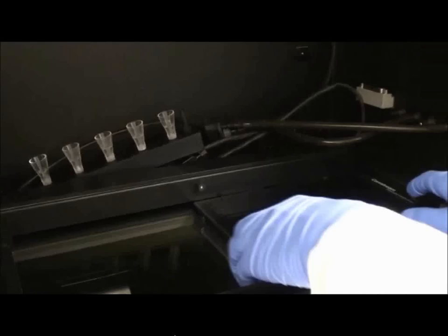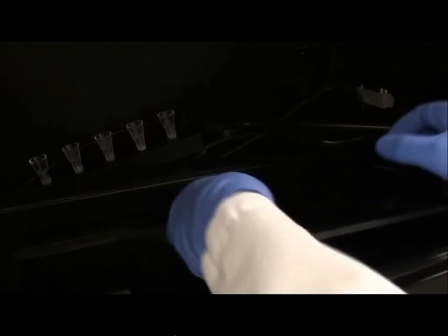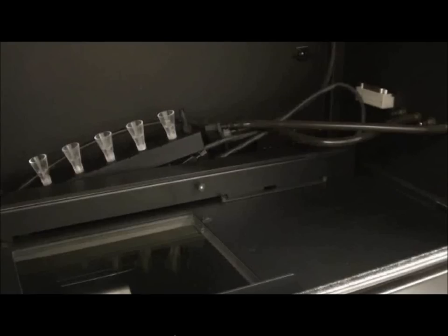The exchange for these screens is fairly simple. Remove one screen by pulling straight up from the positioning pins. And then install the exchange screen by positioning it on the available pins.